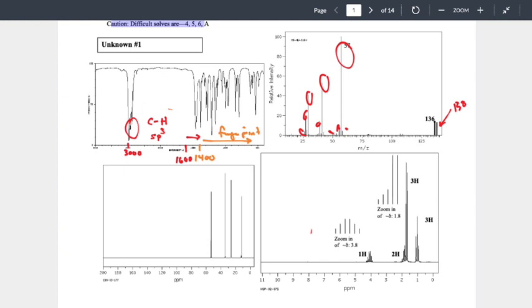Outwards, right? The bomb is on the inside of it, explodes, and the pieces curl outwards. What if the bomb's in the car parked next to it? The car explodes outwards, punching into the mailbox, pushing all the pieces inwards. So I could dissect where the bomb was located based off of the explosion patterns. I can look at those pieces to decide what's going on with it. That's what's happening within mass spec.